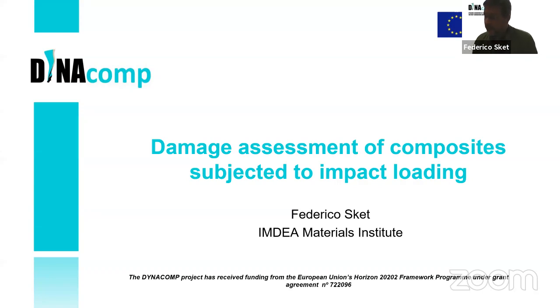This is a webinar that is going to be delivered in the frame of the DynaCom project, as John mentioned. And the idea of this presentation is to give a brief overview of the way the damage is evaluated in composite materials when they are subjected to impact loading. I will particularly focus on X-ray tomography as a qualitative and quantitative characterization technique, and I will explain how this evaluation can be carried out.